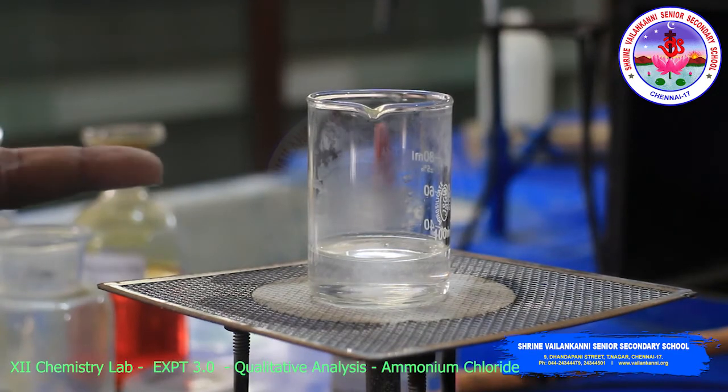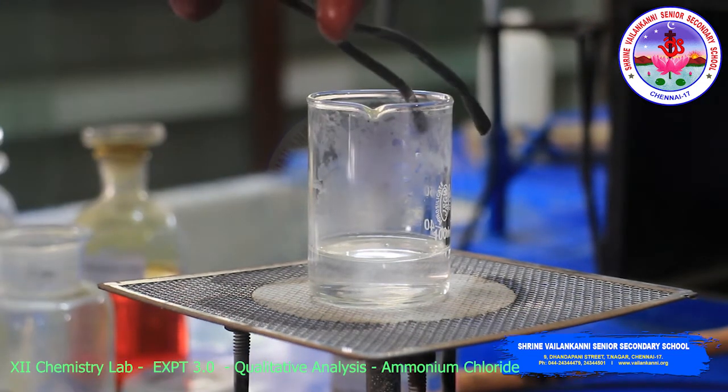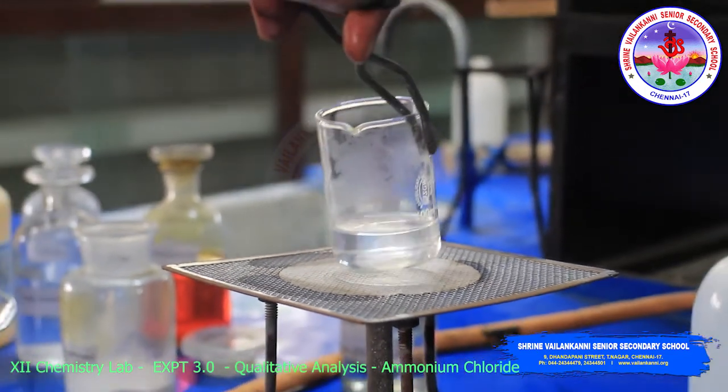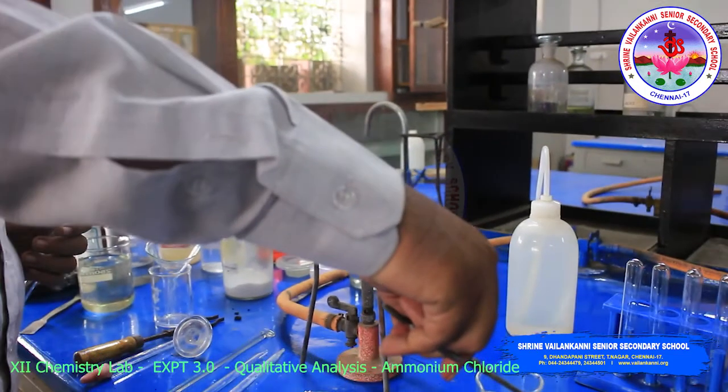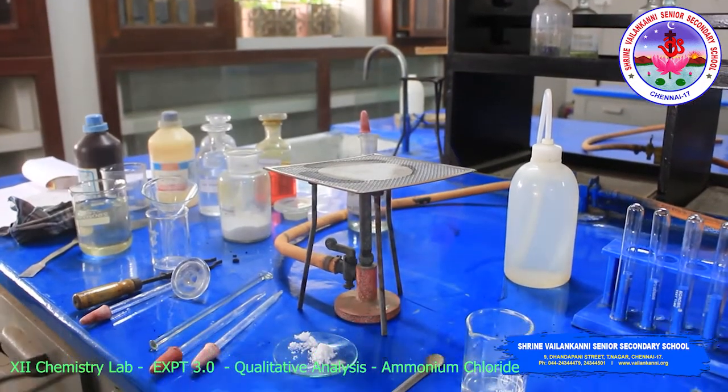Now boil this extract, then remove it with the help of tongs and allow it to cool for some time. Then perform your test.